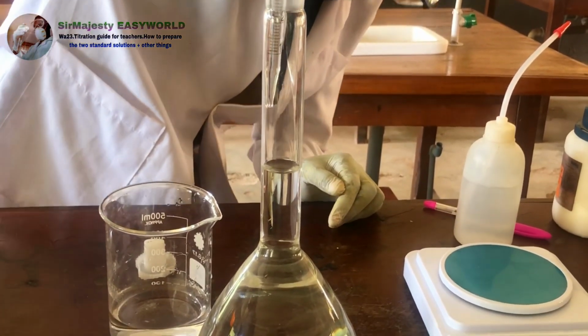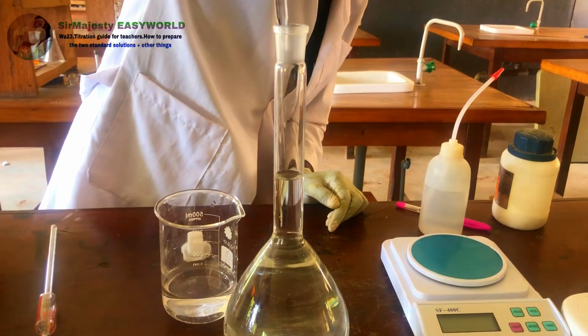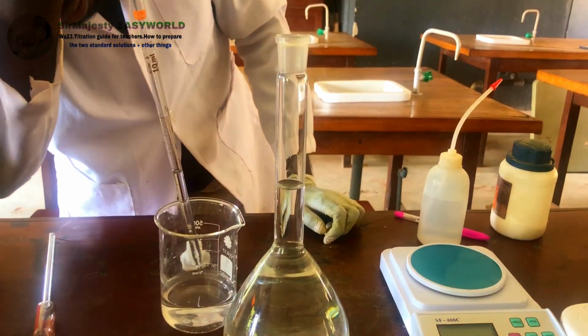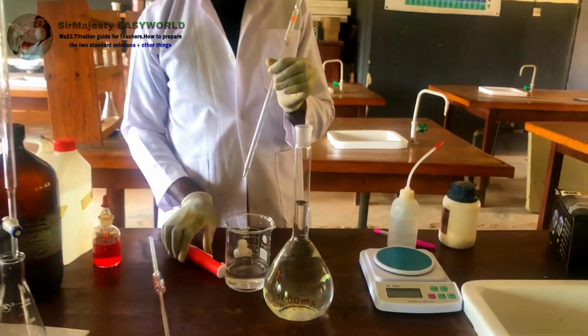Keep your eye level so as not to see a double line. Yeah, that's on the line. Yes, you got it on that ring. Exactly, no mistakes. So you have actually prepared solution A.